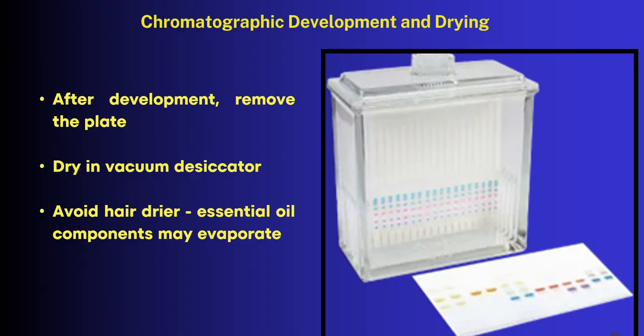Once the solvent reaches the predetermined development distance, the plate is removed. After development, the plate contains residual mobile phase, which must be removed by drying before detection. Avoid using a hair dryer, as there is a chance of evaporation of essential oil components.